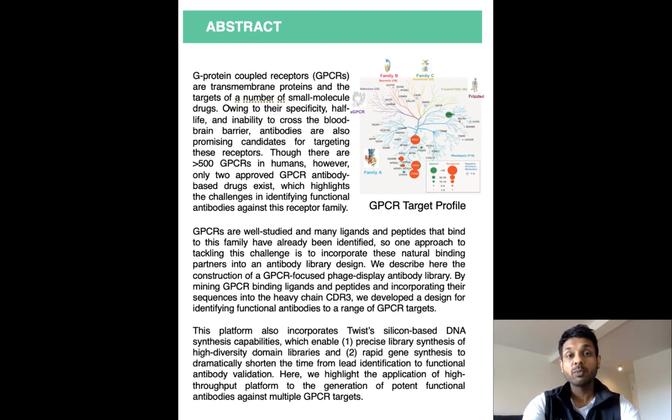So we at Twist Biopharma decided to use this binding information to design an antibody library that was focused towards this GPCR family.